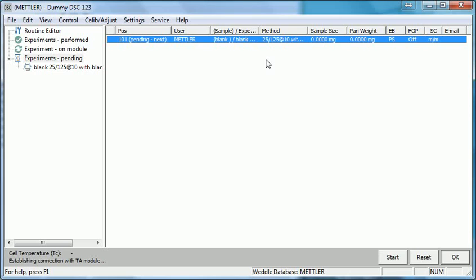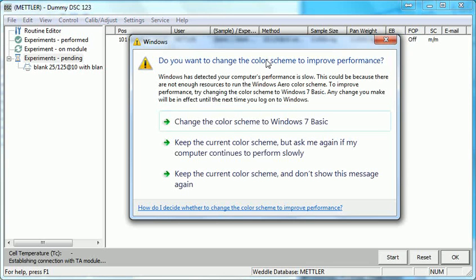Otherwise, if it were left at insert temperature or standby overnight, it would continue to use liquid nitrogen, or it would keep your cooler on, trying to maintain the insert temperature or the standby temperature. But if you go to power save, it'll turn those off on that last experiment. Okay, that's all for now.